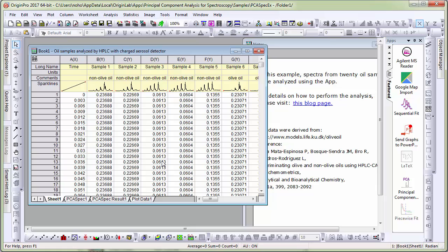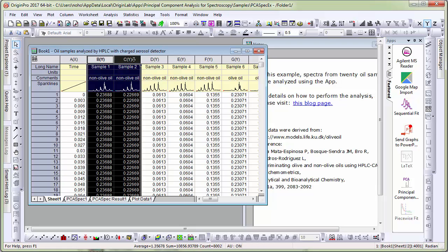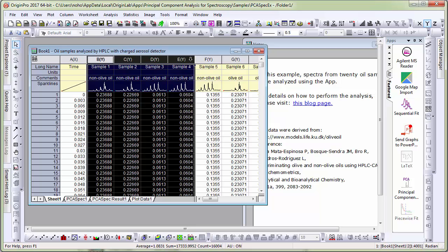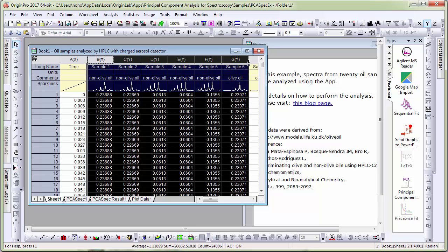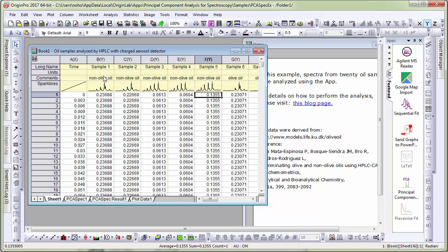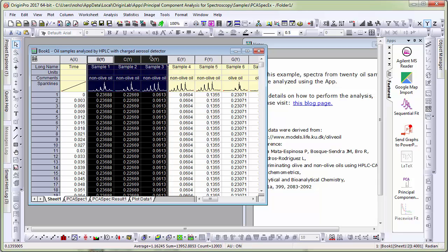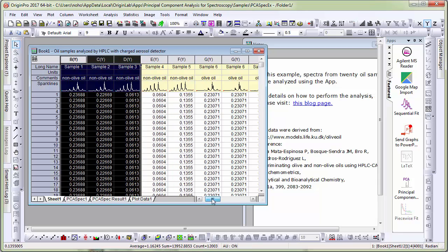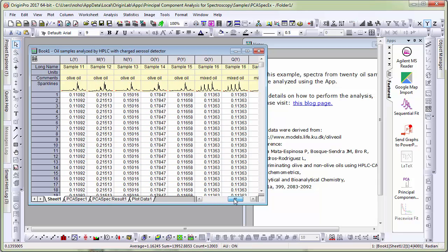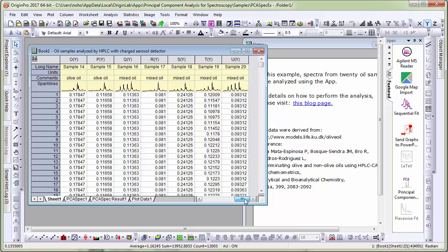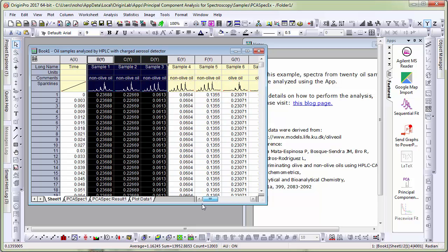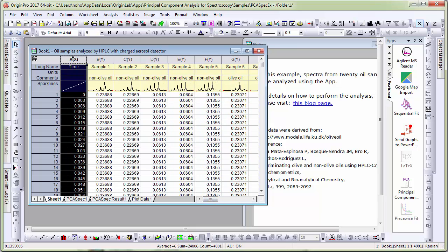I have a worksheet here with many columns of spectra grouped using information in the comments. I have non-olive oils, I have olive oils and I have mixed oils and a column with a timestamp.